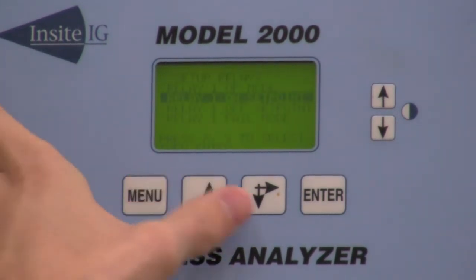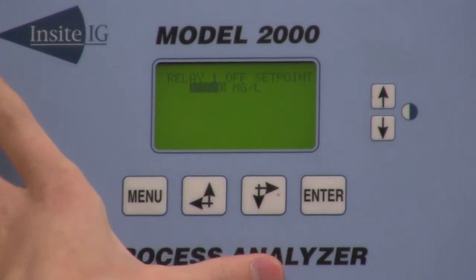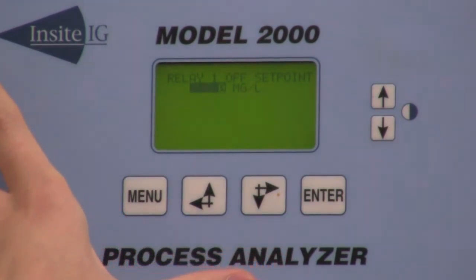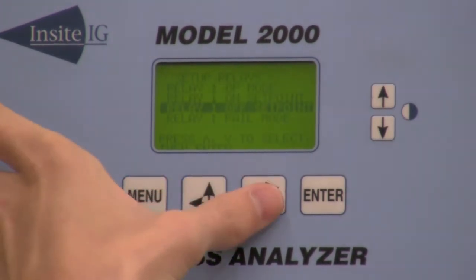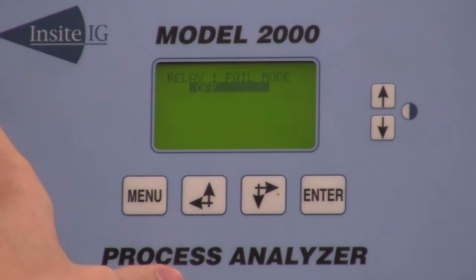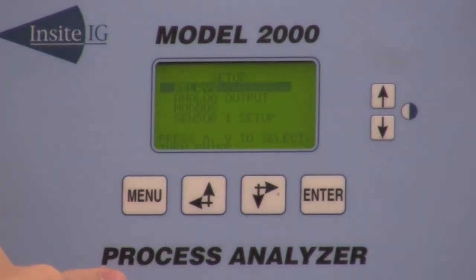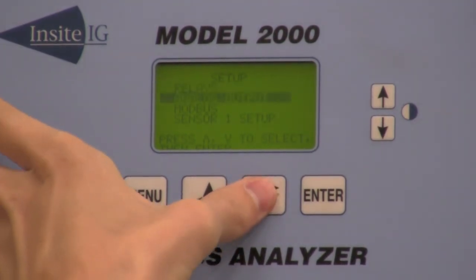Then drop down and go to relay one set point off — this is where you're going to have your set point come out of alarm. Then you have relay one fail safe mode. That's it for the relays. You can then go back and do that same process for relays two and three.